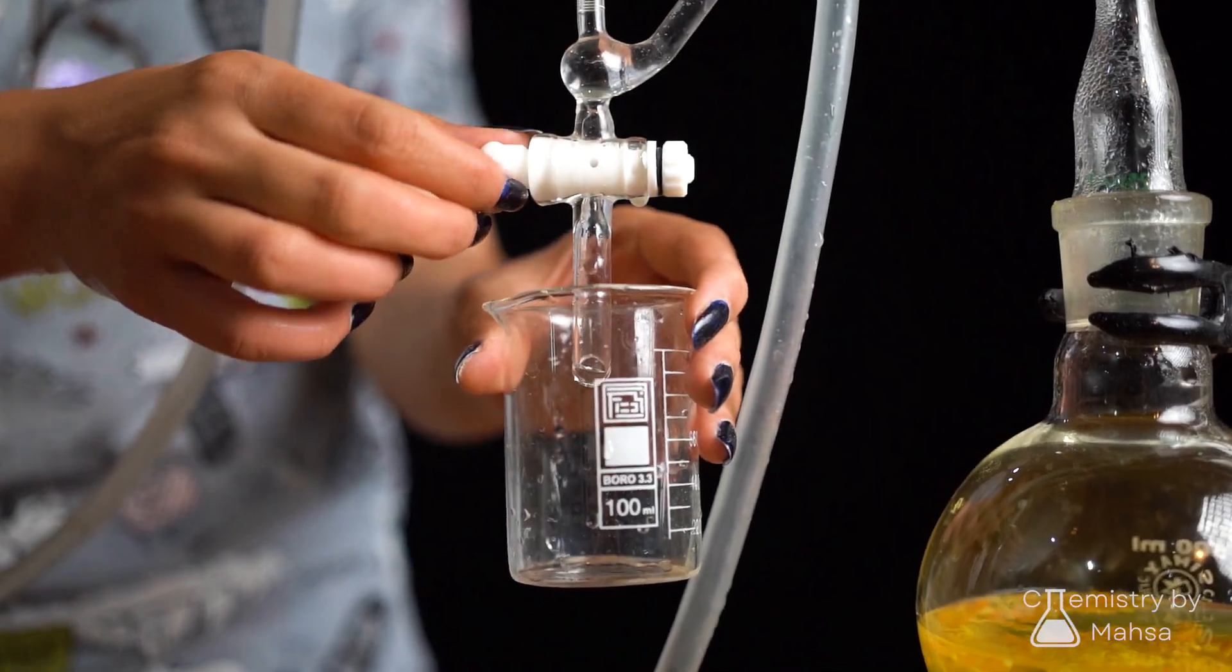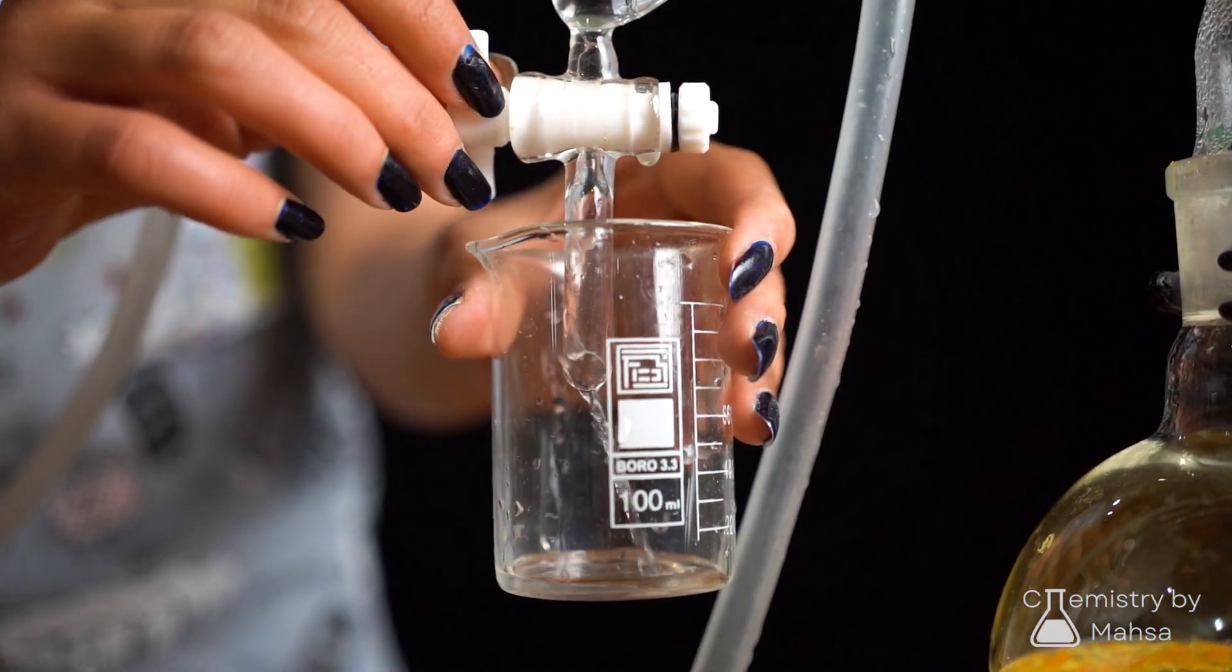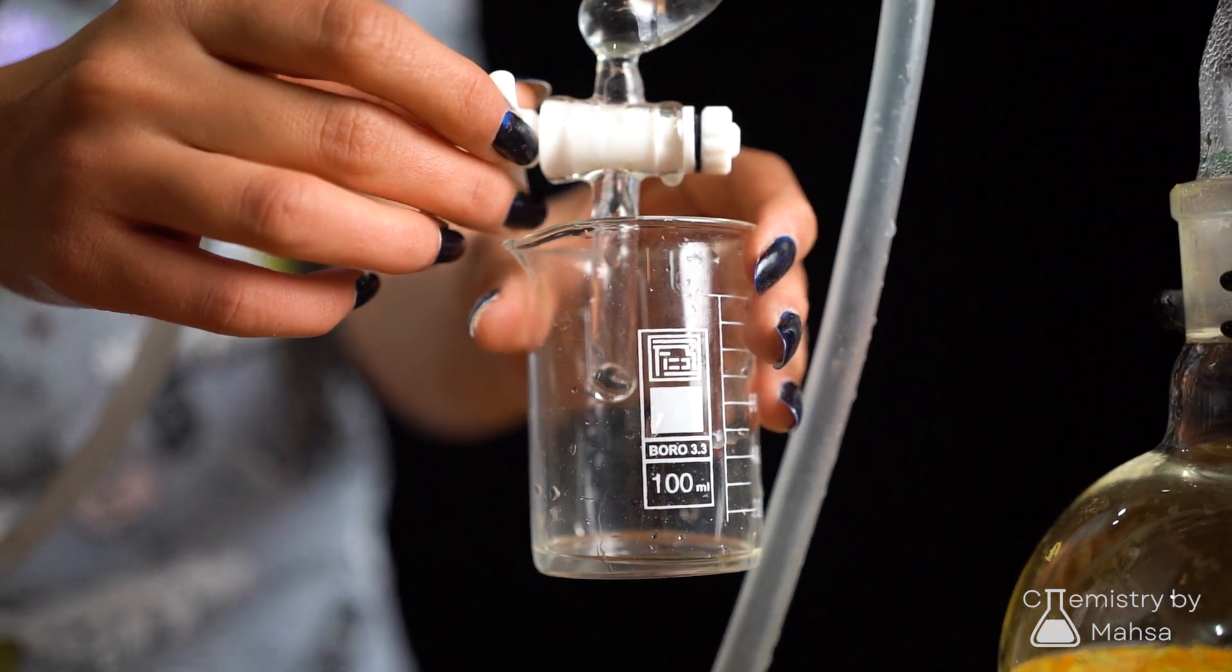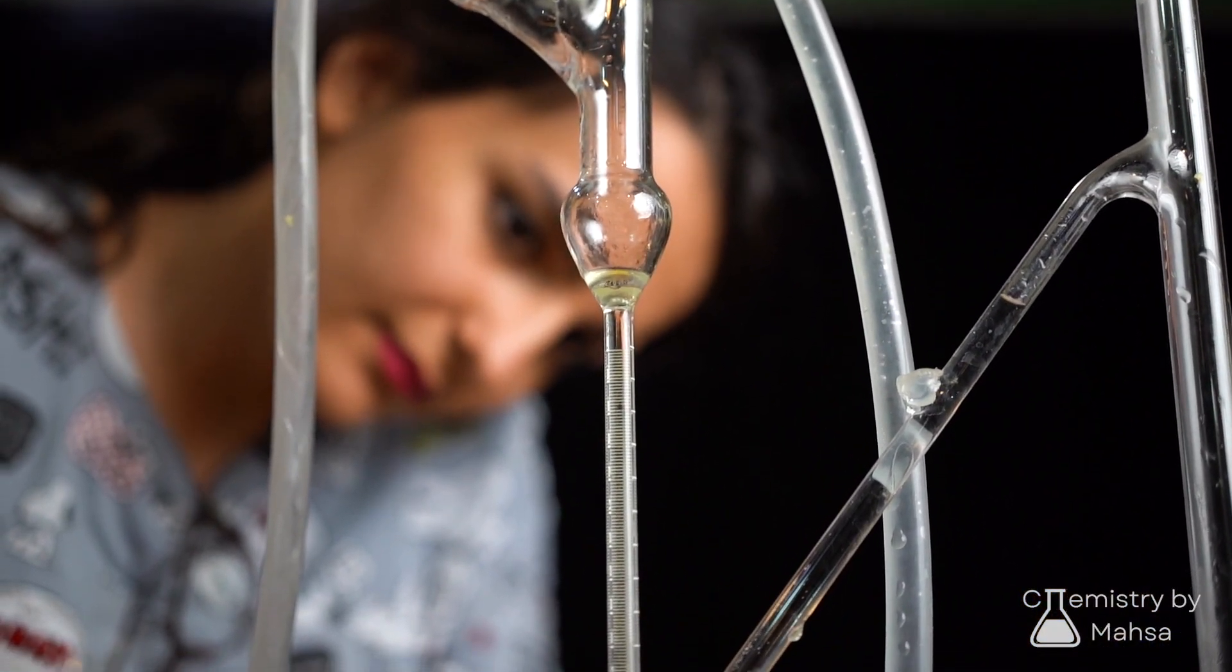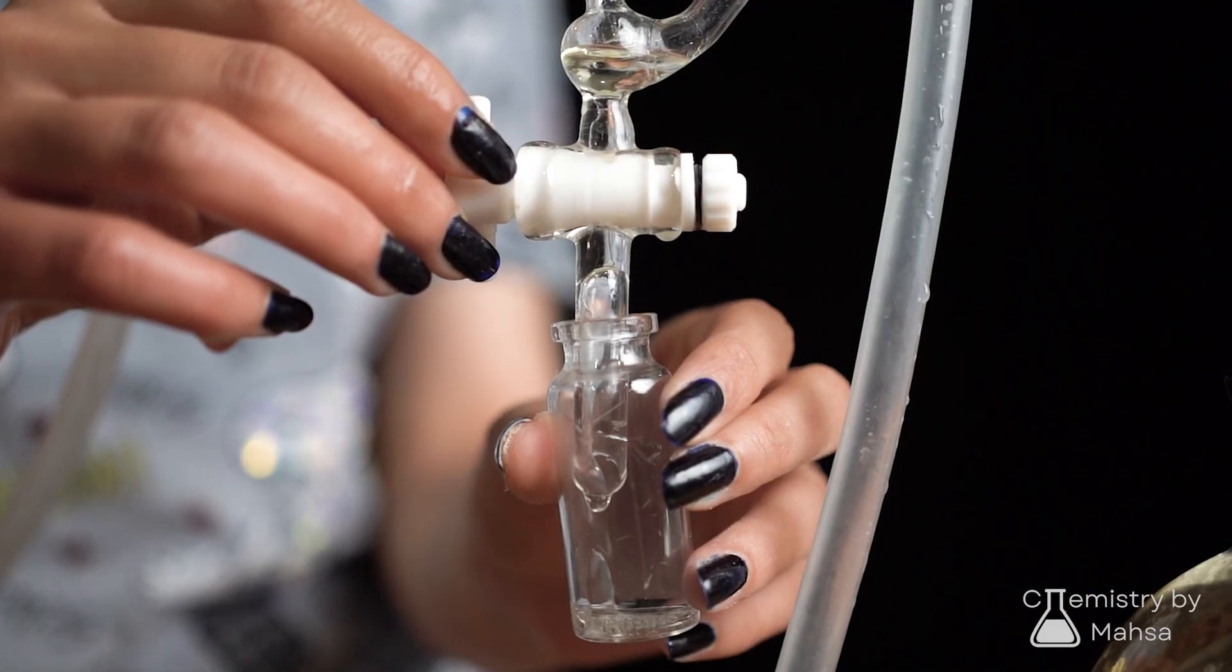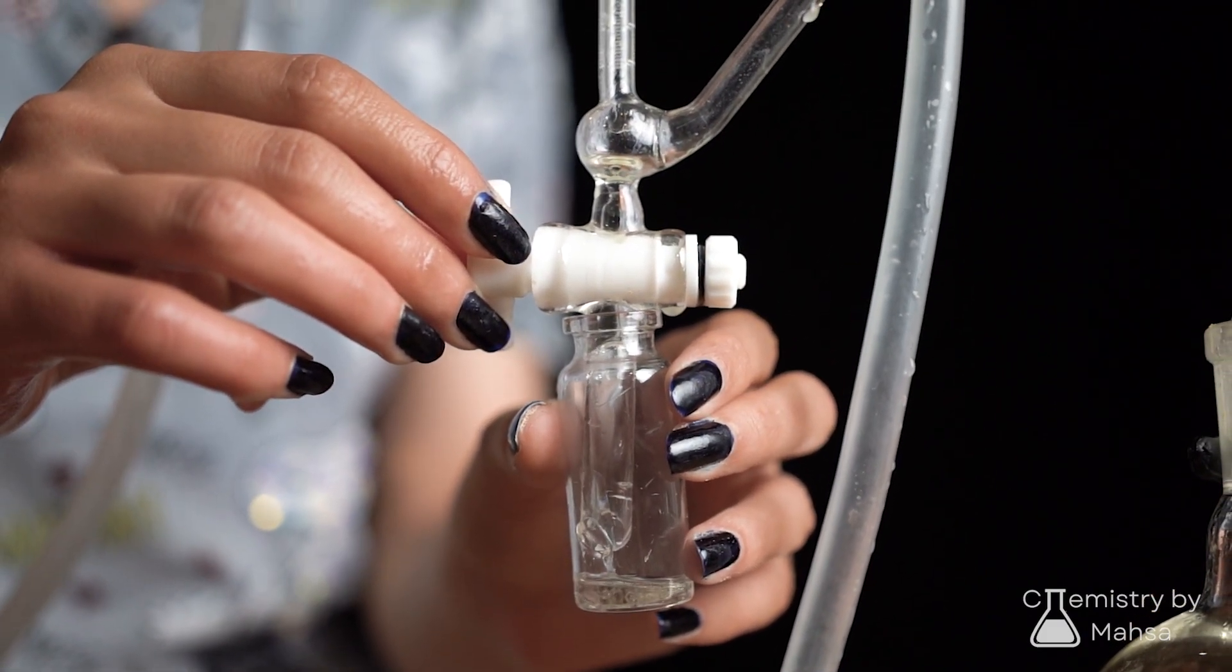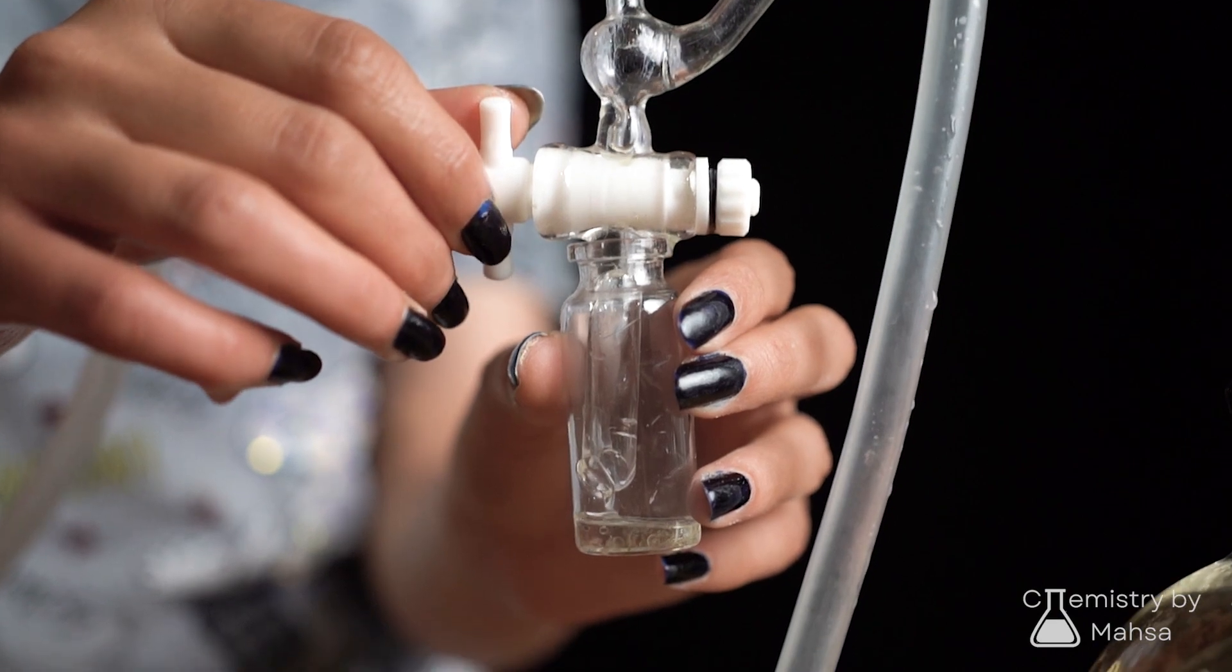After a couple of hours, you can see two layers forming, and the one on the top is your essential oil. You can tell when the process has finished when the amount of essential oil is not increasing anymore. For more accuracy, you can use a separatory funnel, but here I just use the Clevenger's own valve.